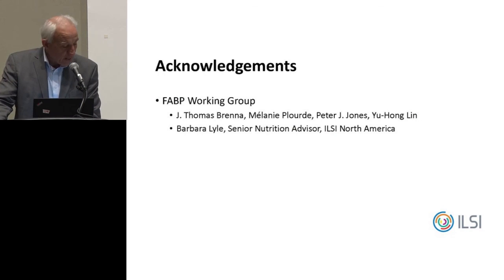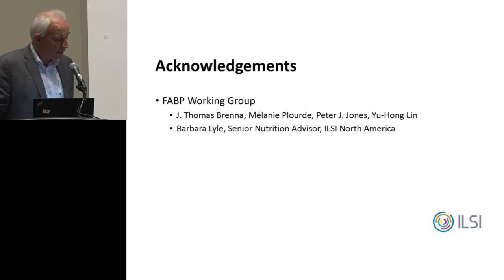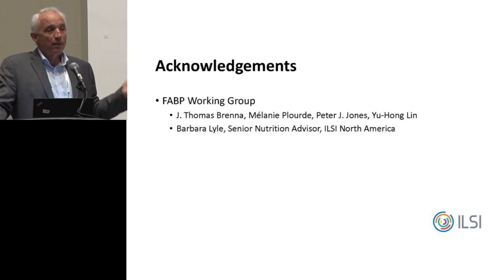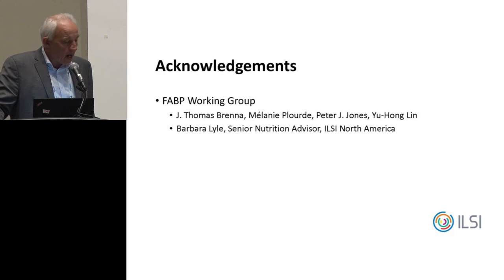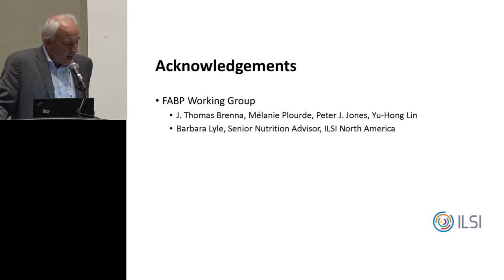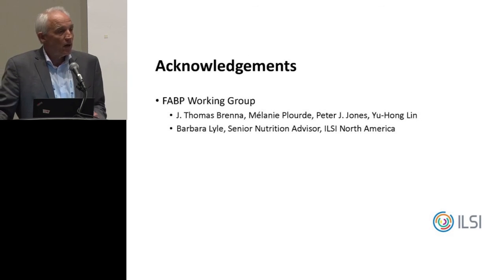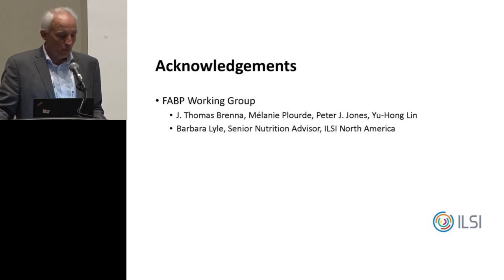So that's it. I would just offer as a final comment that I think the 4 elements of analysis, that is sample collection, sample preparation, analysis, and particularly data reporting, all need to be done in a way that is well documented, that adheres to existing literature norms, and is properly described and articulated in any manuscript that one is submitting for publication. So we hope that this manuscript will be of value to you as you work your way through fatty acid analysis.